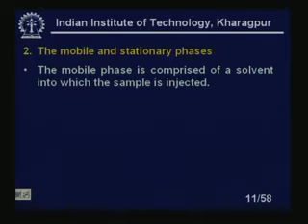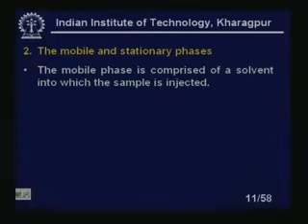The mobile and stationary phases are two things we are repeatedly mentioning. The mobile phase is comprised of a solvent into which the sample is injected.